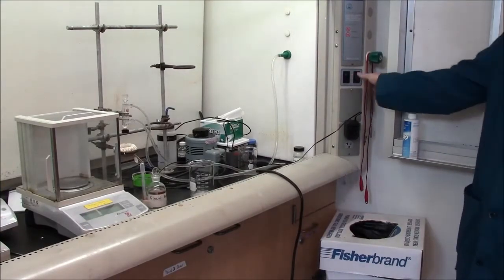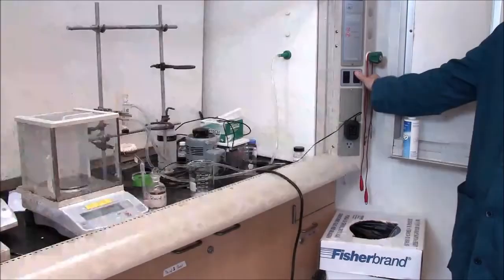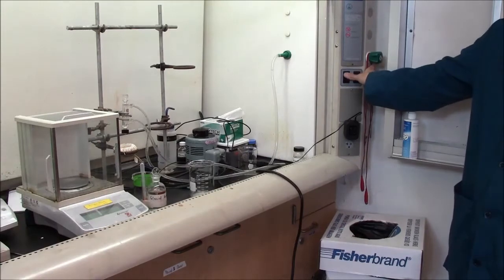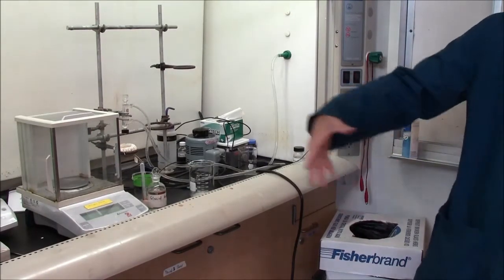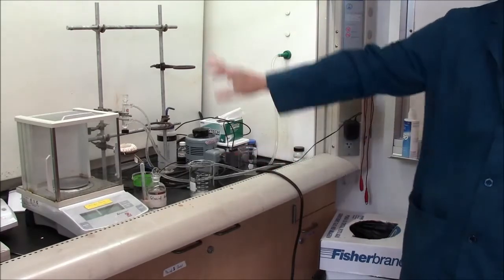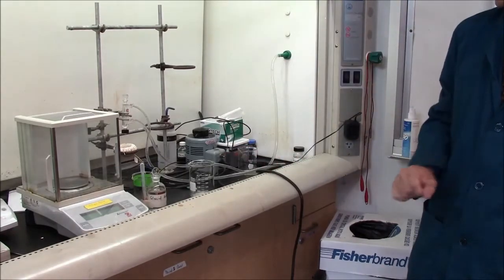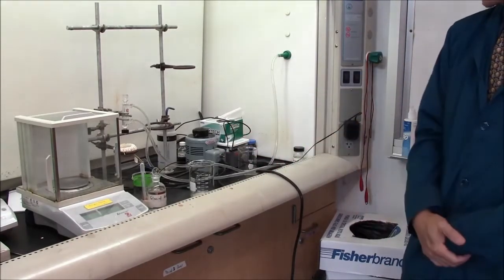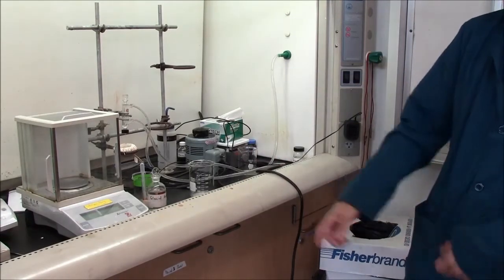The fume hood has two switches, one for light and one for the fan. The fan pulls air from the room and sends it up a smokestack on the roof. This is to keep you safe from any harmful vapors or irritating vapors.